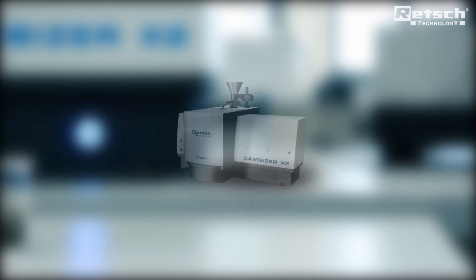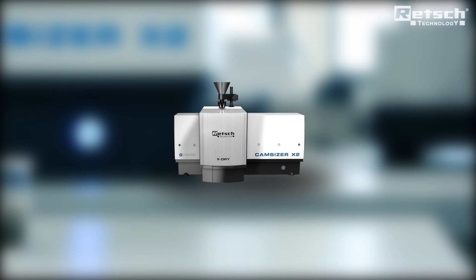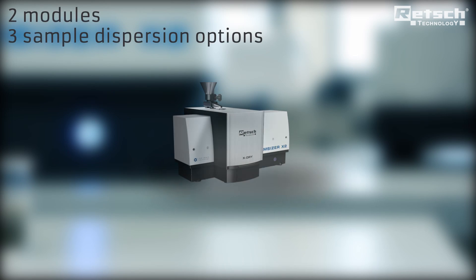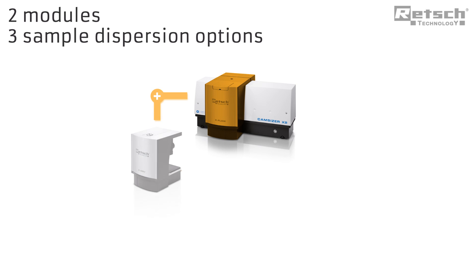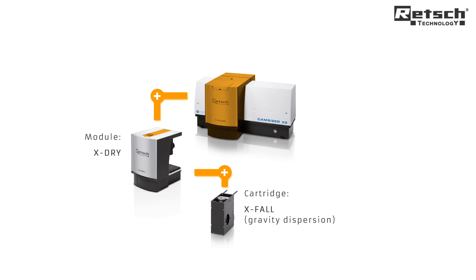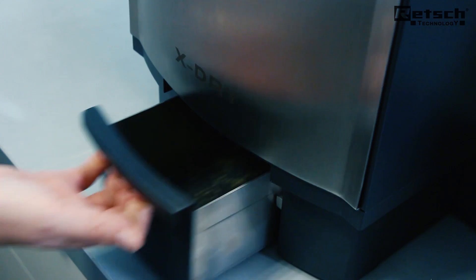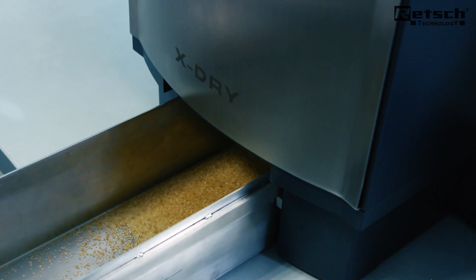The CamSizer X2 is suitable for measuring dry and wet samples. It features two modules with three different sample dispersion options. The dry dispersion module X-Dry can be equipped with two different cartridges. The gravity dispersion cartridge X-Fall is used for pourable solids and free-flowing bulk materials. The whole sample can be recovered after the measurement.